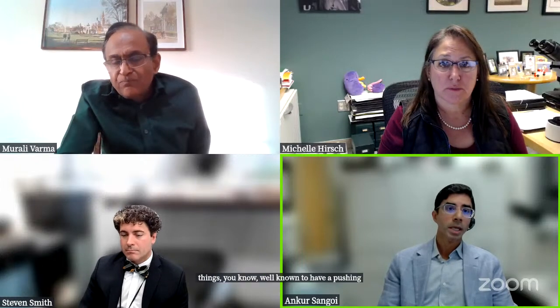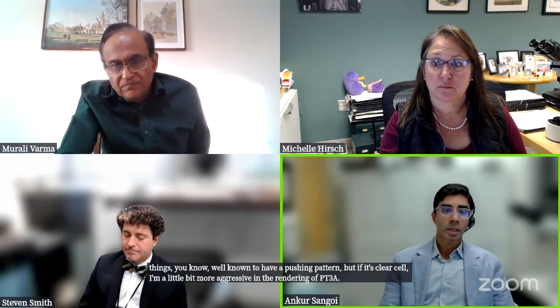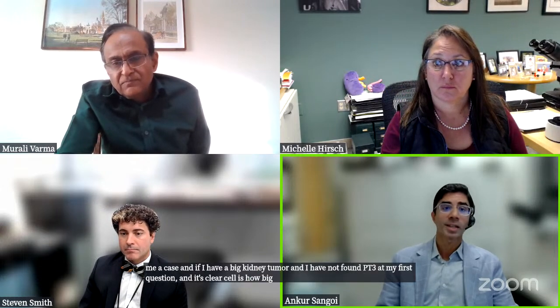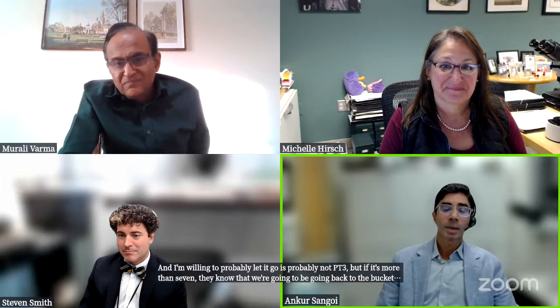But if it's clear cell, I'm a little bit more aggressive in the rendering of PT3A. And then the other thing, especially that size cutoff. When the trainee brings me a case, a big kidney tumor, and I have not found PT3A, my first question, if it's clear cell, is how big is it? Actually, before I even start, I say, because if it's under 7, I'm willing to probably let it go, it is probably not PT3A. But if it's more than 7, they know that we're going to be going back to the bucket later that afternoon, because I'm a big believer in that Boston study.